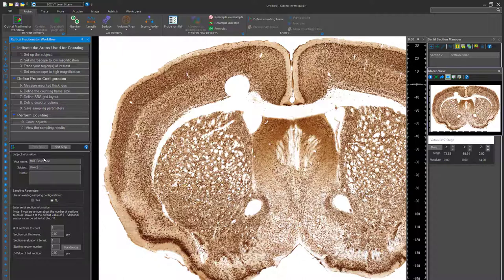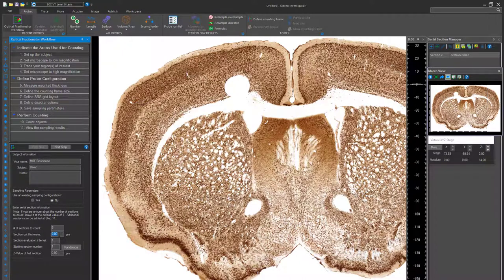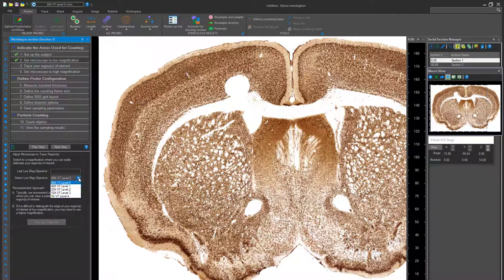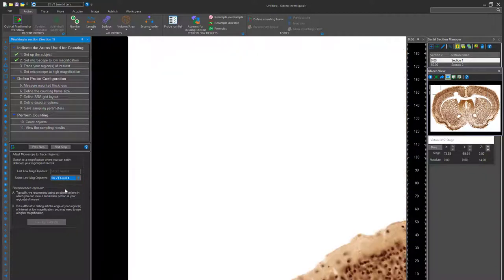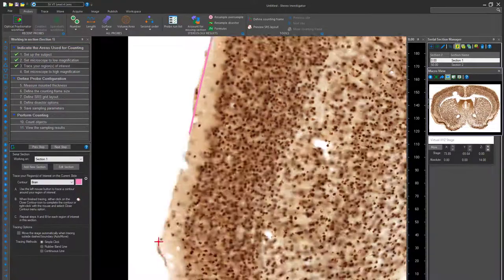First, the Optical Fractionator. After clicking on the workflow tab, you will be asked to do the initial setup. Set your microscope to low magnification and move on to trace your area, or areas, of interest.